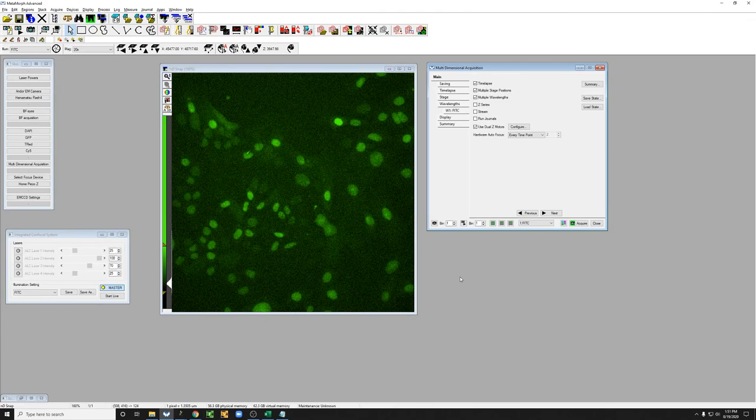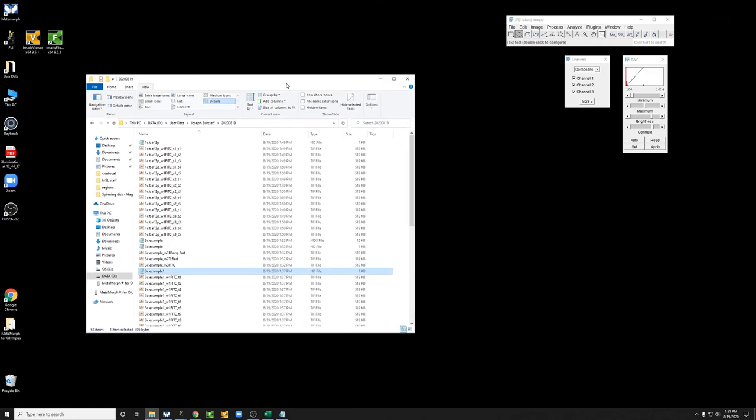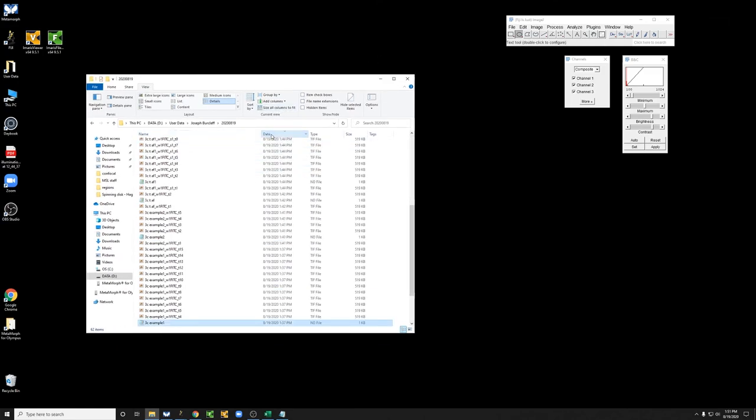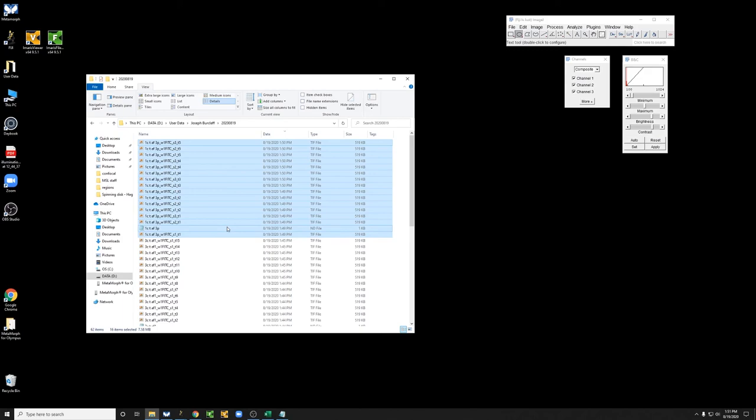So the acquisition has concluded. Let me show you what the resulting data looks like. If you look at the folder where this data ended up, you can see here it is. These are the data that were just created. So you can see there's one file per channel.